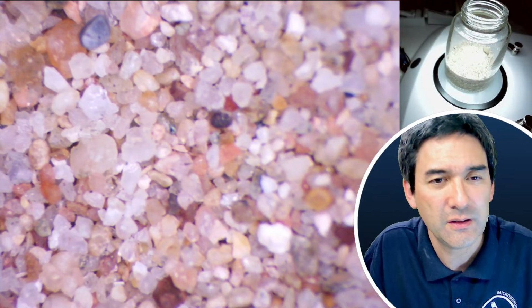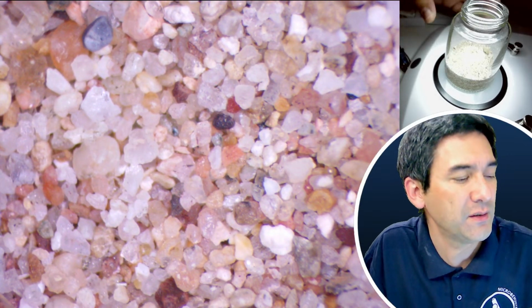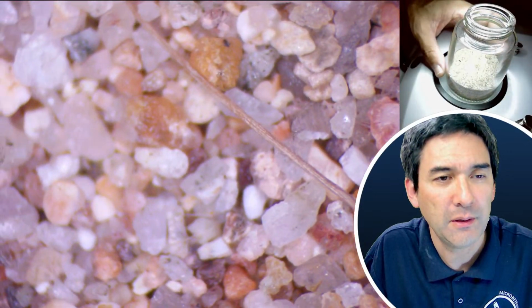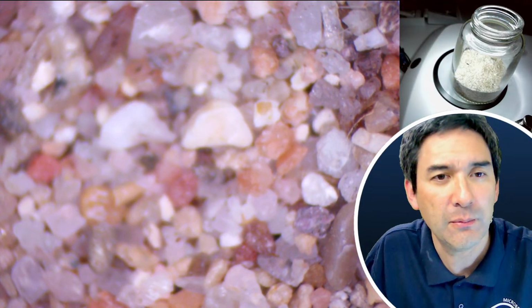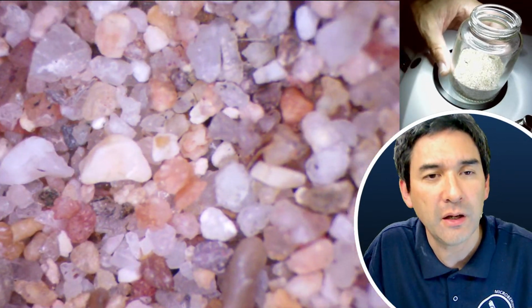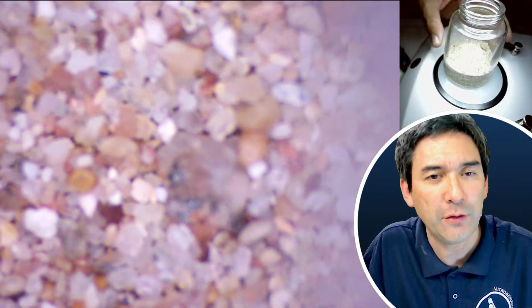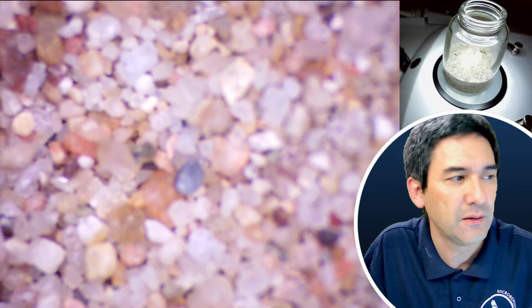I'm not so totally happy with the image quality of this camera, and the reason is it's not so much the camera's fault, but I think that the intermediate optics of the camera are not quite as good. And the camera's small sensor also adds an additional level of magnification, right? I'm not post-processing these images here. I could actually add a little filter to increase the contrast. And as you see, it goes a little bit out of focus, and the reason is because the sand is not totally flat.